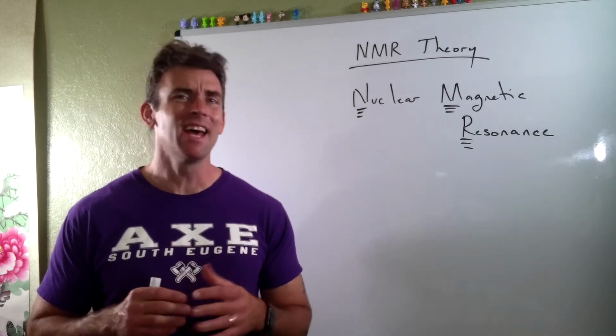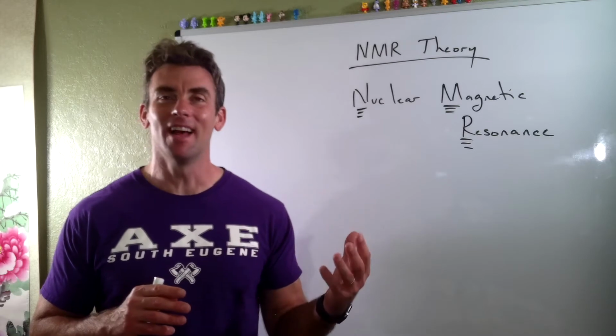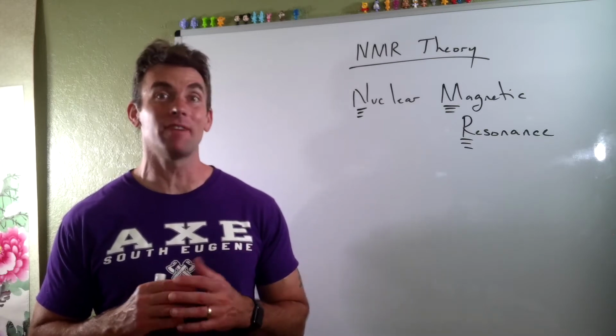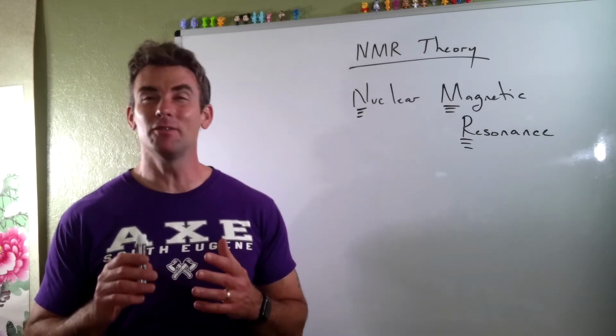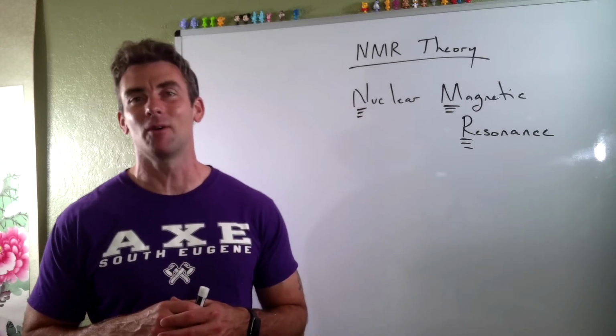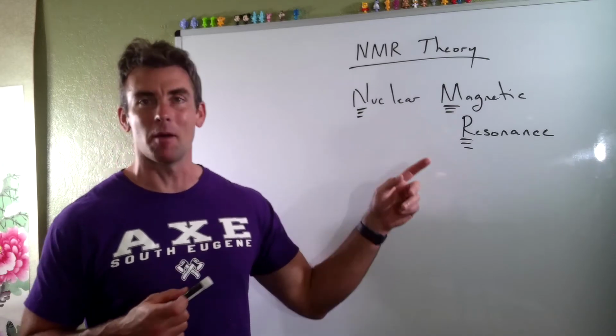And as I said, if you don't understand what I'm talking about right now, don't worry, you will. It's something that requires quite a bit of physics. So if you haven't had physics, it may make things a little bit more difficult. But I'll do my best to give the stupid organic chemist way of understanding what's going on behind this nuclear magnetic resonance, which is NMR.